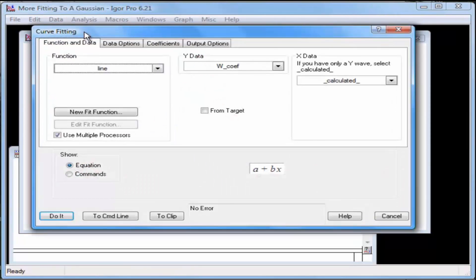This opens the Curve Fitting dialog. Click the Function and Data tab if it's not already selected. From the Function pop-up menu, select Gauss.